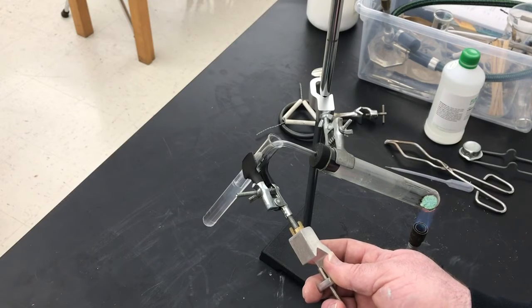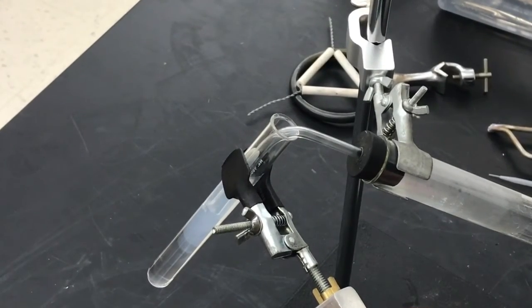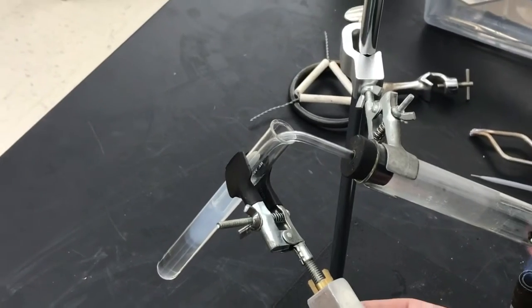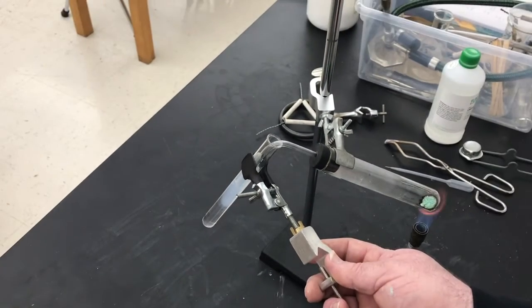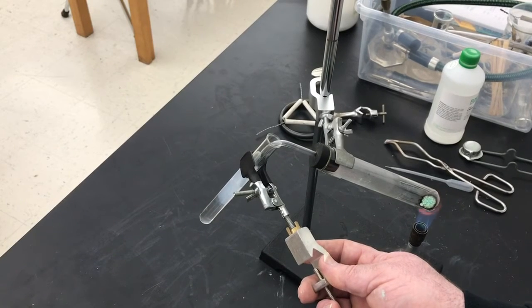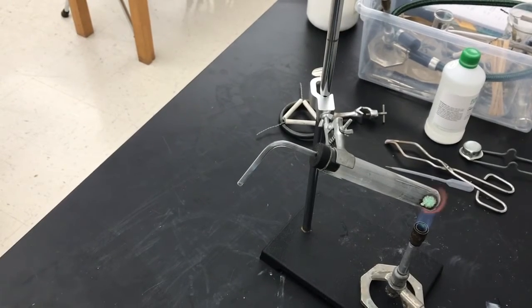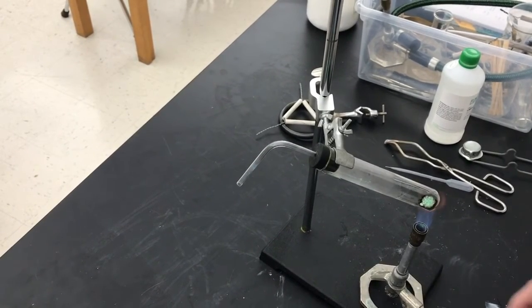And hopefully, oh, there we go. You might notice that we are getting a bit of cloudiness. So, as we said earlier, that indicates carbon dioxide. Ta-da!